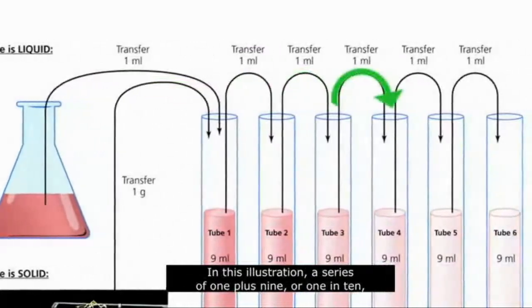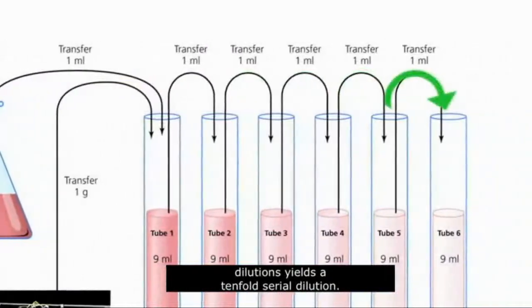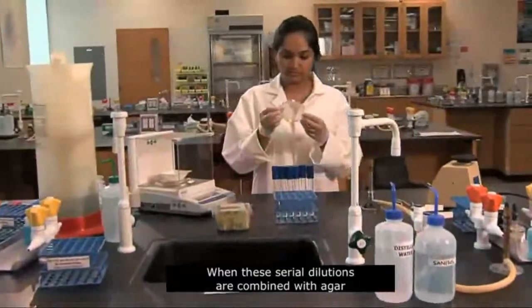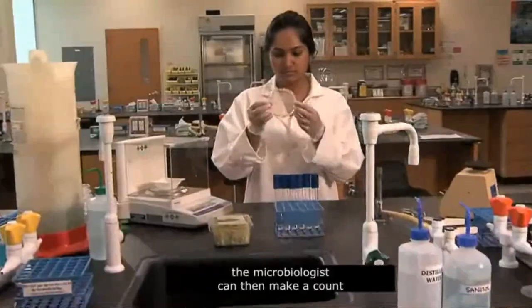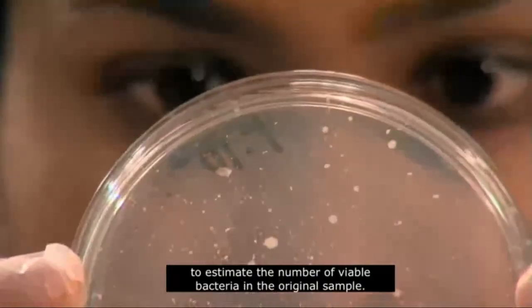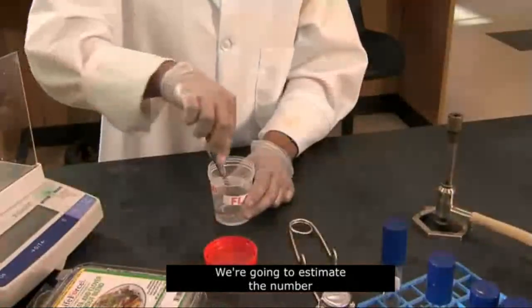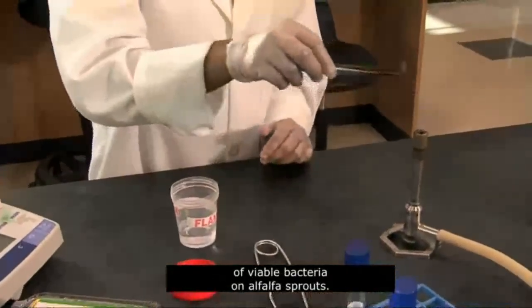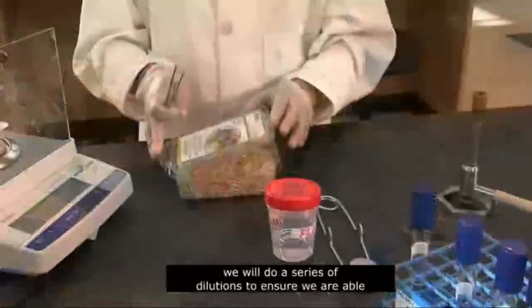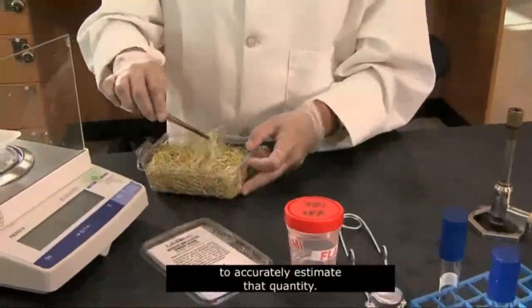In this illustration, a series of 1 + 9, or 1 in 10 dilutions yields a 10-fold serial dilution. When these serial dilutions are combined with agar and incubated, the microbiologist can then make a count of the resulting colonies, which can be used to estimate the number of viable bacteria in the original sample. We're going to estimate the number of viable bacteria on alfalfa sprouts. Because the quantity of bacteria on these sprouts is unknown, we'll do a series of dilutions to ensure we are able to accurately estimate that quantity.